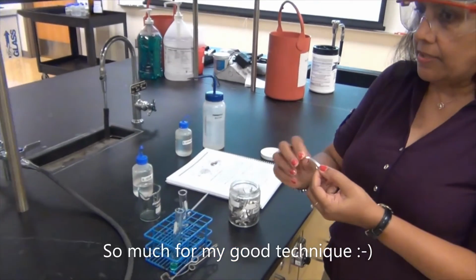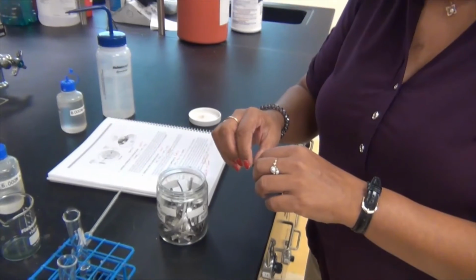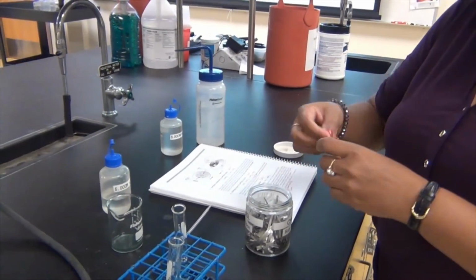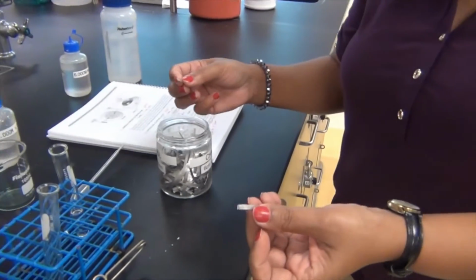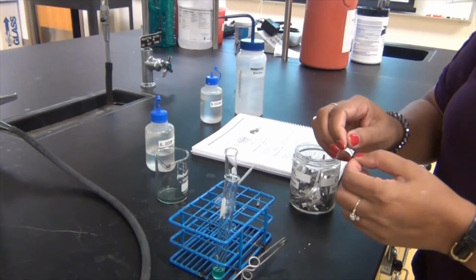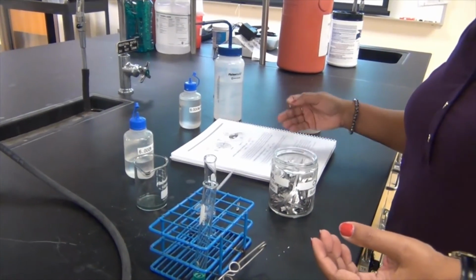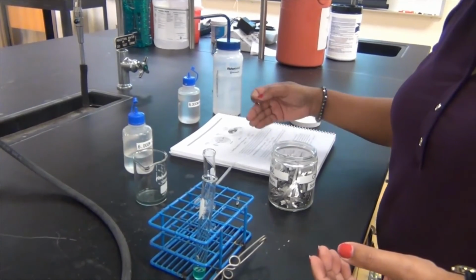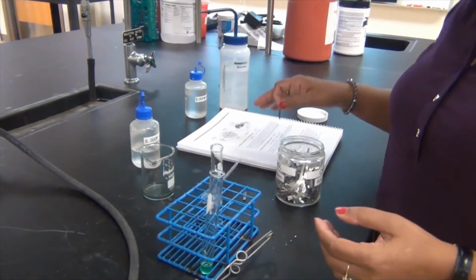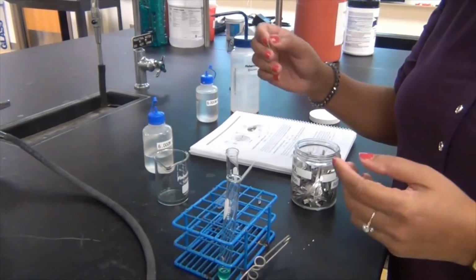So this is the magnesium strip you've used before, and we're going to use this again. I'm just going to take a small piece of this, and see how easy it was to break that. Okay, so I'm going to take half of this and throw it in there and we'll see what happens. And this is actually the last step also. So this is going from copper sulfate, because the sulfuric acid turned it into copper sulfate, going to copper. So we are actually at the last step. Okay, this is the cycle complete.